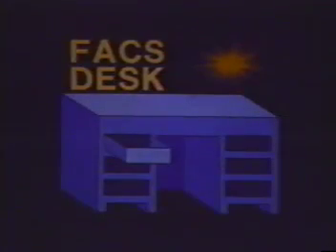The only command to be cautious of is Control-C. If Control-C is given twice in succession, it can interrupt the desk system. If you have any questions while running FACSDesk, use the Enter H command to bring the online manual to the screen.